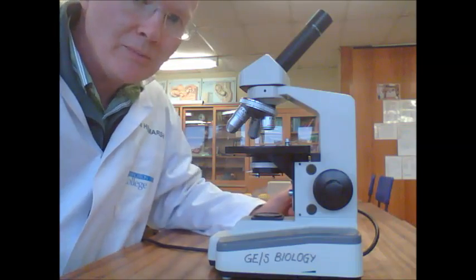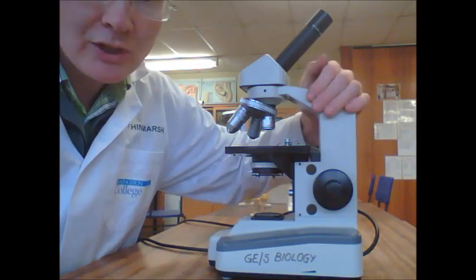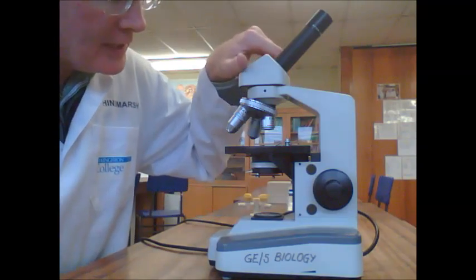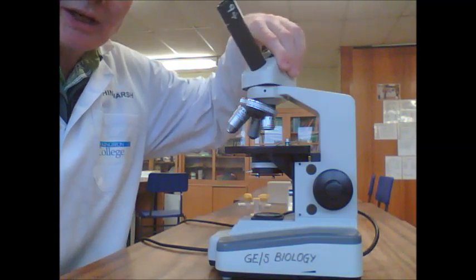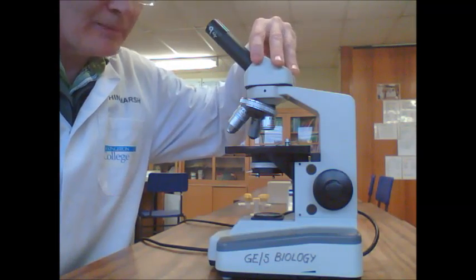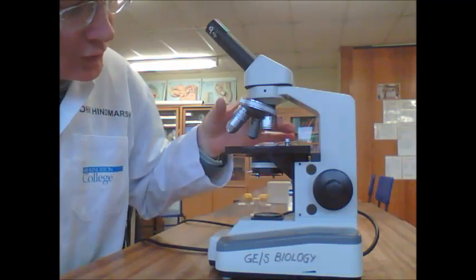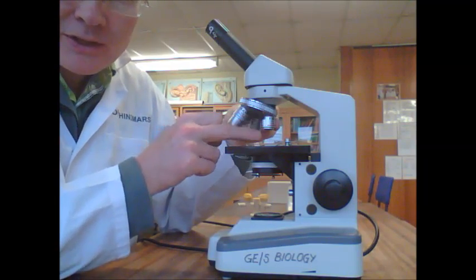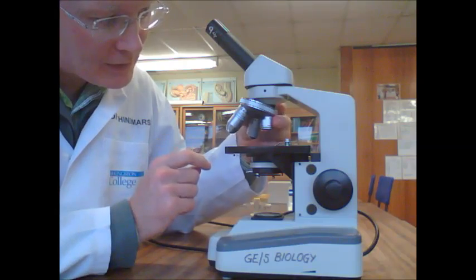To use your microscope, when you get your microscope, turn it so that the frame of the microscope is away from you. Then you need to turn the eyepiece tube towards you. Make sure you've got the low power objective — that's got a red band on it. This is the shortest of the three objectives, and you need it in place.